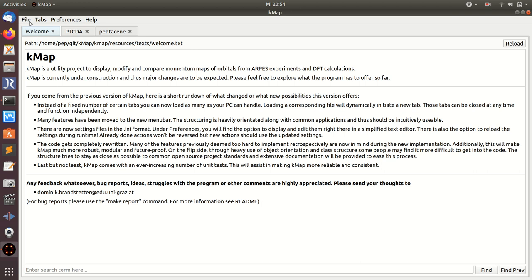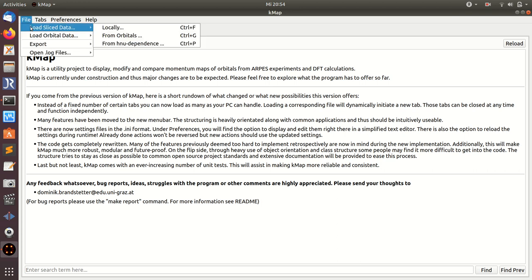In this video I'm going to show you the basic functionalities of the sliced data tab which is used to display data cubes of photoemission intensity as a function of usually parallel momenta components kx, ky and a binding energy, or kx, ky and a time delay of a time-resolved experiment.